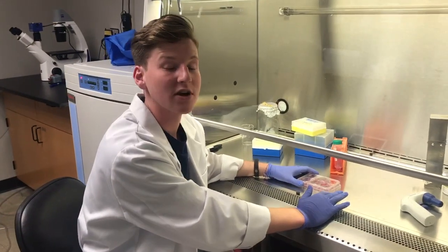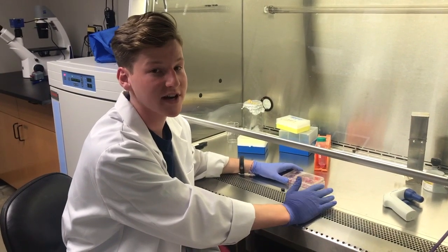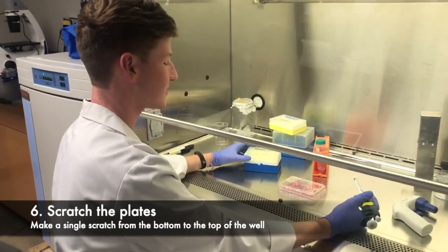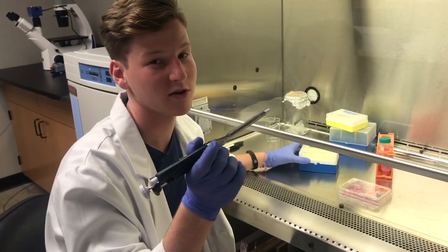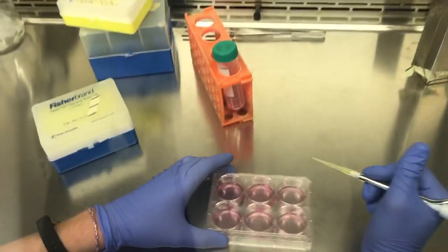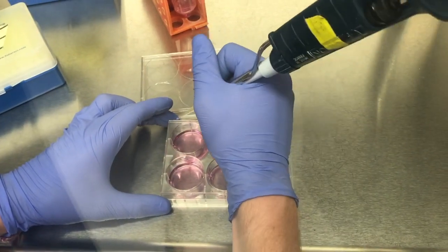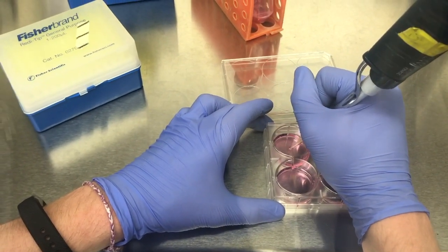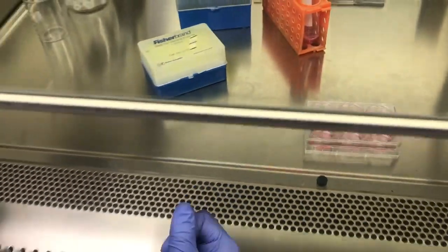Now that I've replaced the normal serum with low serum media, if you're using a drug treatment you can incubate for however long you need, or you can move straight to the scratch. For the scratch, you should use a 200 microliter pipette tip — it helps to put it on the end of a pipette and hold it like a pencil. When making your scratch, be as sterile as possible, don't accidentally dip your finger in the well, and start at the top going all the way down.